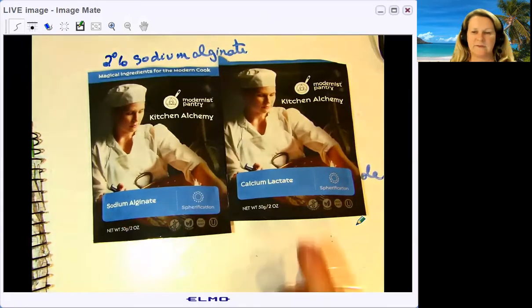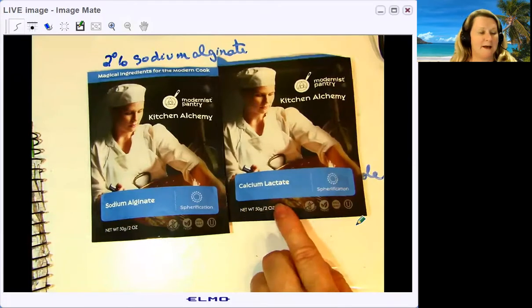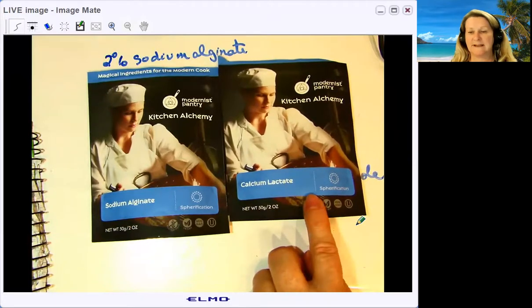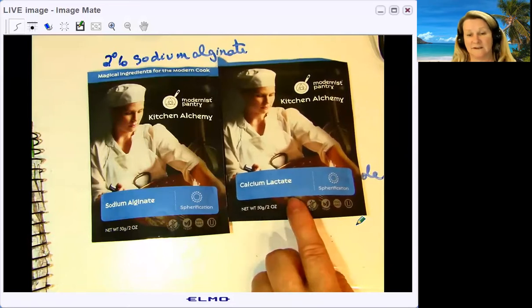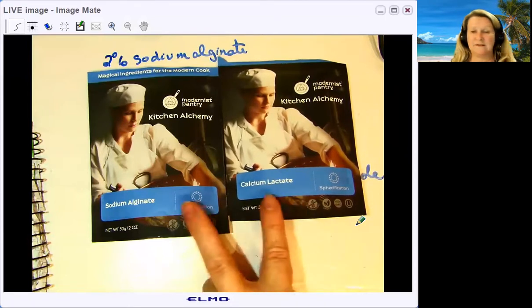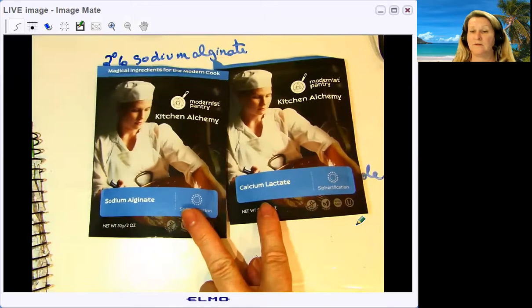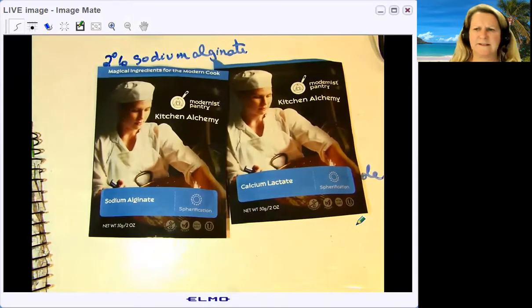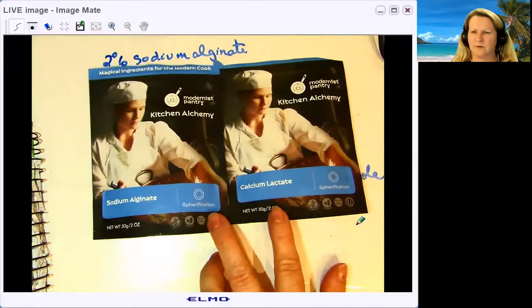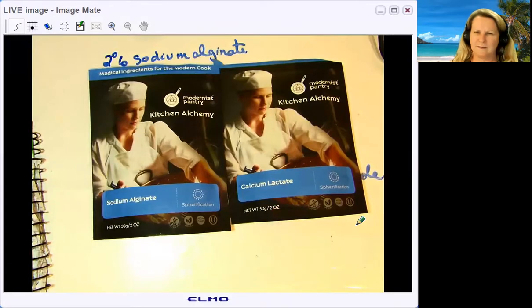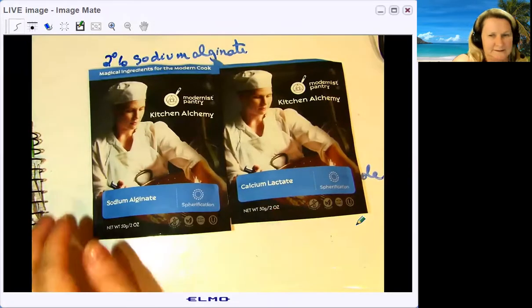In Pam's version of the lab, she uses calcium chloride, which is the way it was originally done and works beautifully. I changed to calcium lactate because it's much safer. In fact, don't tell the kids this, but they could eat this and be okay. These are sold in a two pack on Amazon from Modernist Pantry. Apparently there's this thing called kitchen alchemy, and they use this to make flavor pearls—little pearls like boba for gravies and sauces.